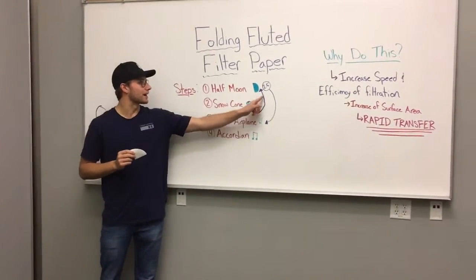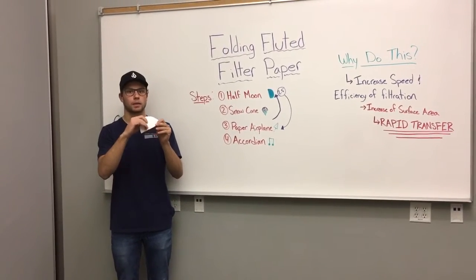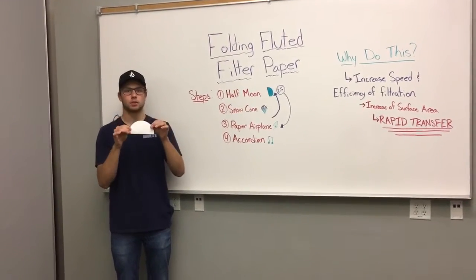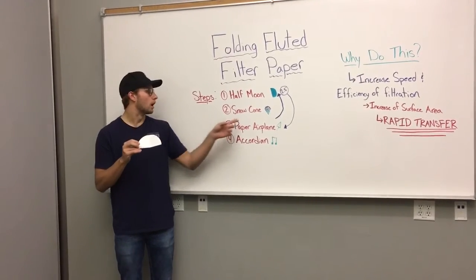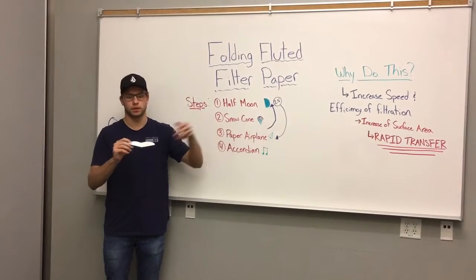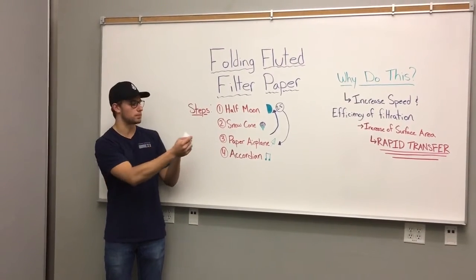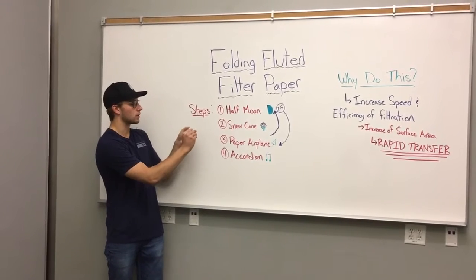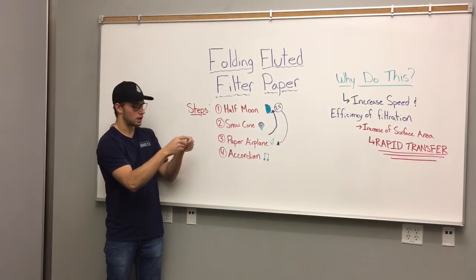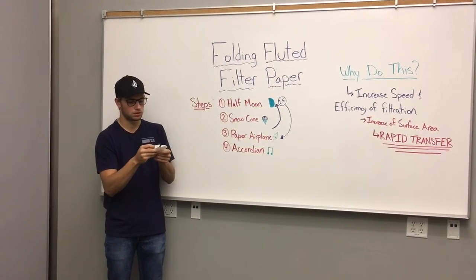Alright, and we're gonna go back to step 2.5. Step 2.5 is we're gonna take our beautiful snow cone and open it back up to our half circle, half moon. Next, from step 2.5, we're gonna do our paper airplane step. We're gonna take our half circle, just like the second step of making a paper airplane, and fold it down the middle crease here, lining up the edge, making a long crease into smaller snow cones.